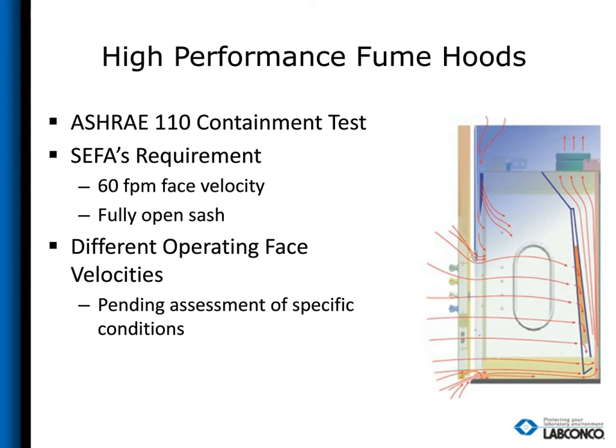In order to see this result, a mannequin is placed in front of a fume hood with a sensor in their breathing zone, which is a very important part of this test since air interacts differently in front of an empty hood versus having a person standing in front of the hood. The air actually hugs around a person and creates eddies or turbulence around a person. So it's more of a challenge when we put the mannequin there.